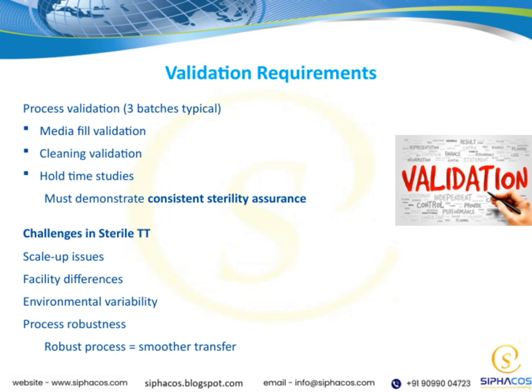And finally, hold time studies, which help us determine how long a product can safely stay in a particular state without compromising its sterility. The most important point here is that all these steps must demonstrate consistent sterility assurance. Nothing is more vital than maintaining that sterility throughout the process.